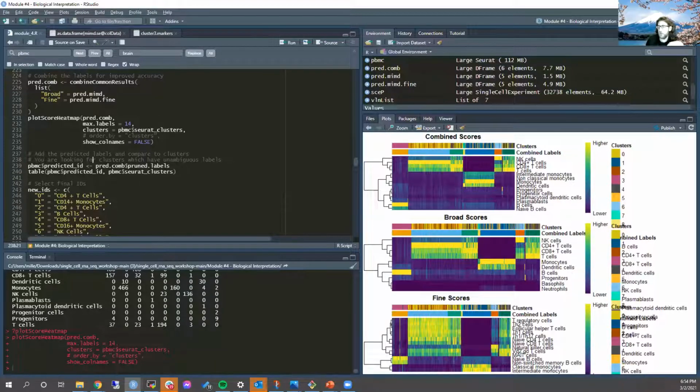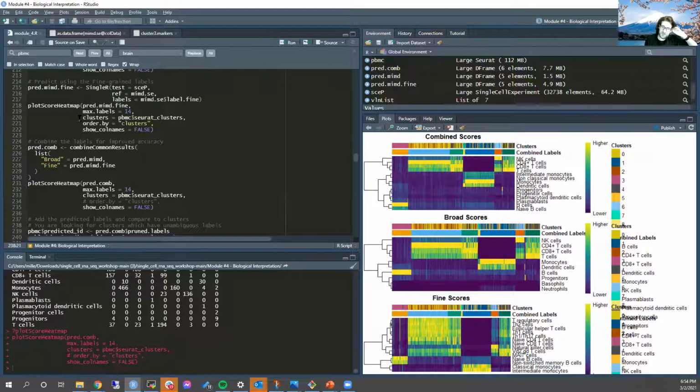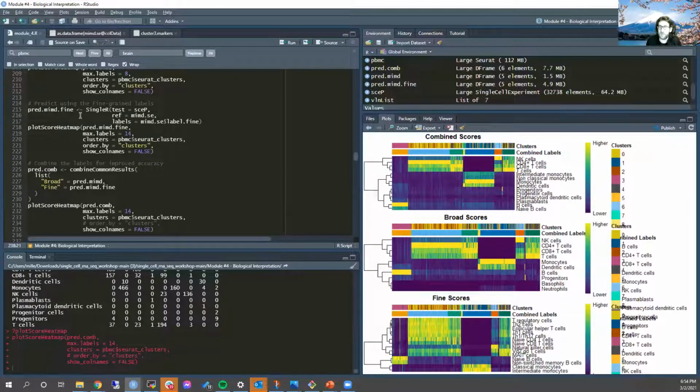Oh, okay. So you're asking if you have lung cells in your single cell experiment, but you only have a label set for neurons, then what are you going to do? Well, two things. One, let's say for the sake of argument that you actually do have a label set that covers neurons, because actually you do.